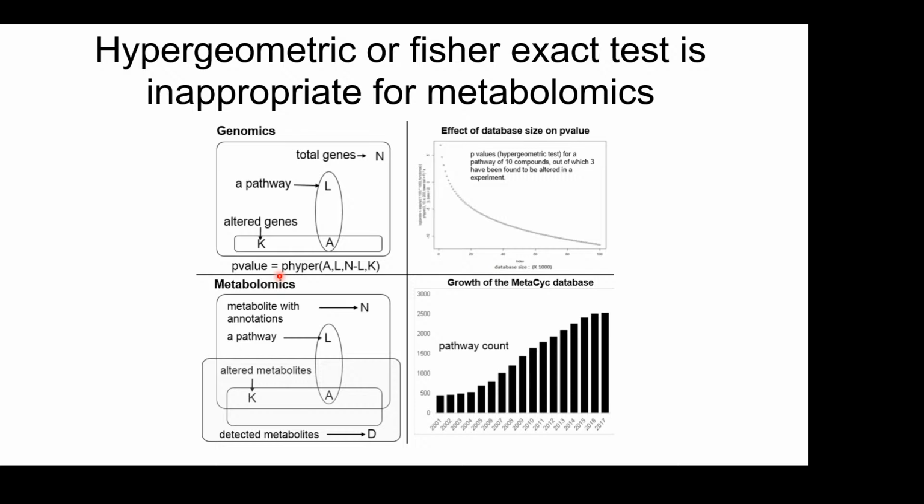It was adopted from genomics, where genetic variants or SNP data were passed through a p-value cutoff, because SNP mutations are random and independent from each other, so it makes sense there. We also know that in genomics the total number of genes is known, which is n.